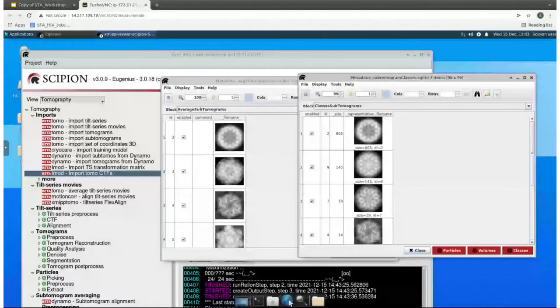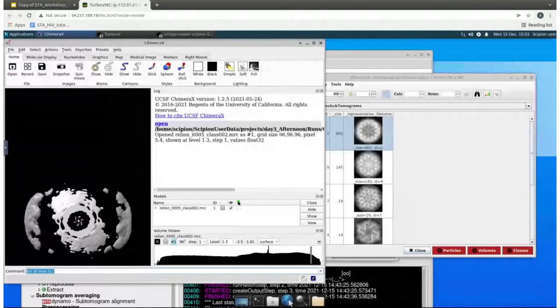And so to see them, what I do is that you just click on them, and then click Chimera. Yes, Marie Jose, I can try to resummarize. What I'm doing is that I'm reviewing the analysis of the results of the classification.